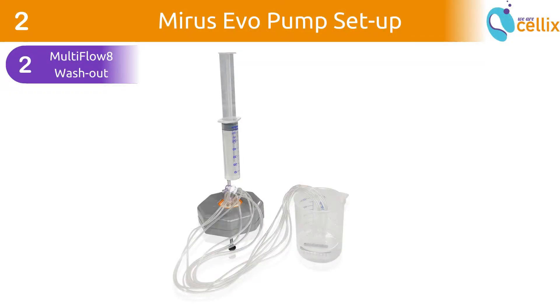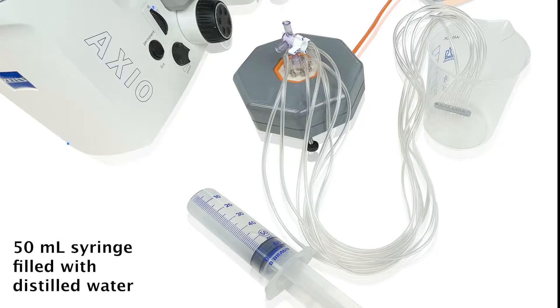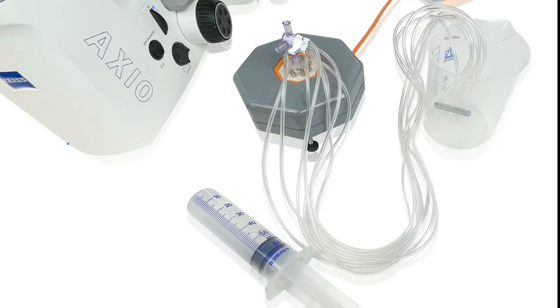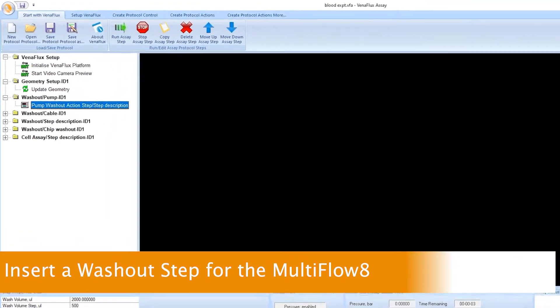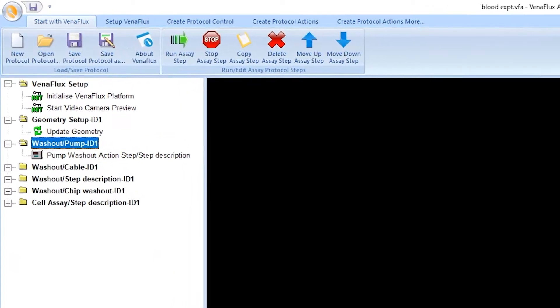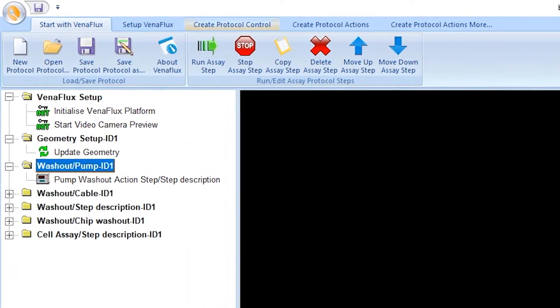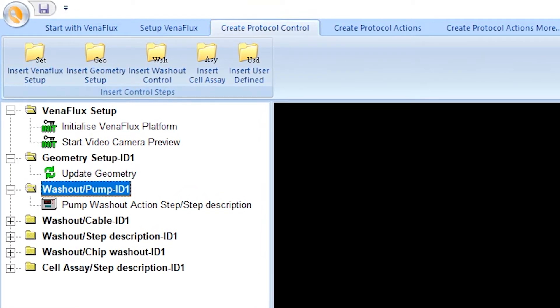Next, we wash out the Multiflow 8 separately before connecting it to the Mirus Evo pump. This is done by using a 50 ml syringe filled with distilled water. As the Mirus Evo pump can also operate without the Multiflow 8, the default protocol does not include this step and must be created. To do this, go to the main menu and click on the tab Create protocol control.